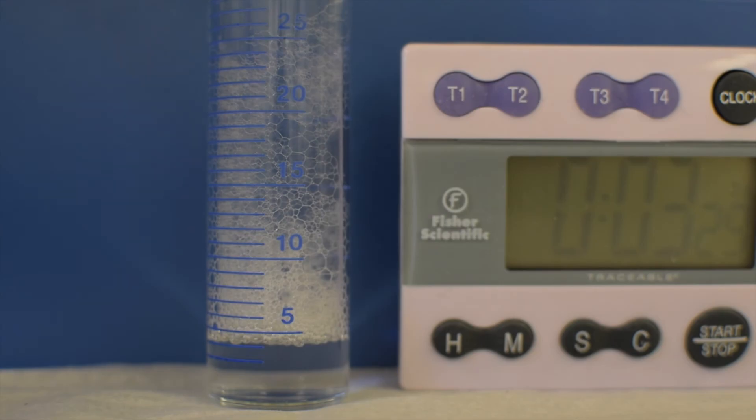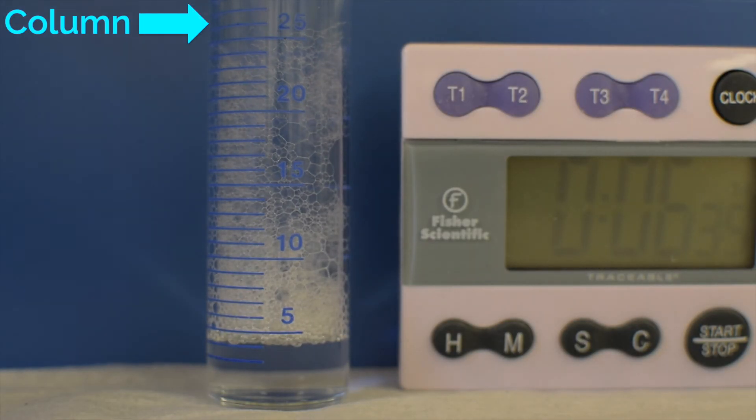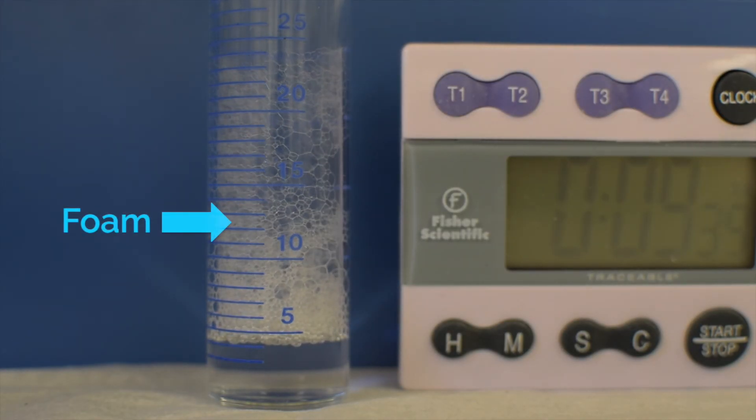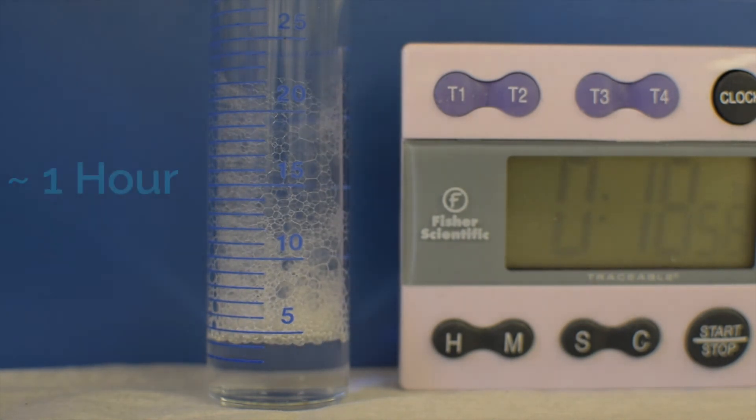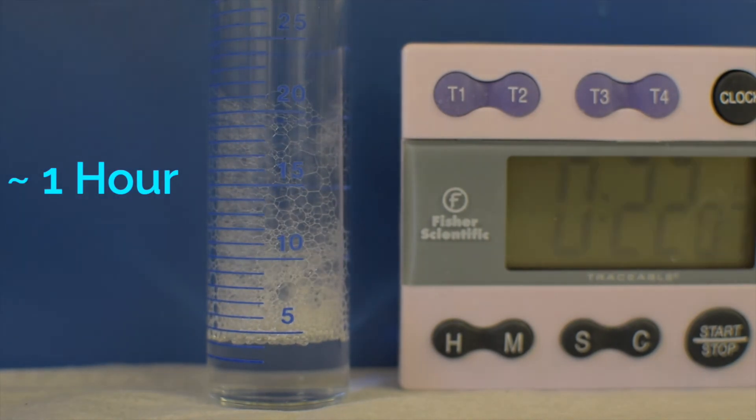Traditionally, foam stability is measured by bubbling nitrogen through a column containing surfactant. Once the foam is produced, the stability is observed over a period of time. In the case shown, the half-life of this foam was roughly an hour.